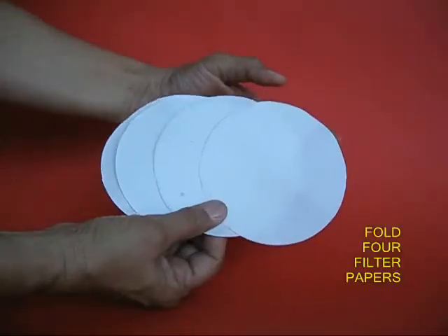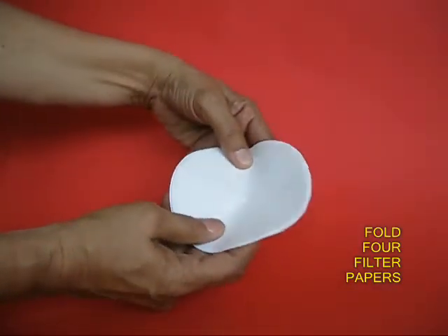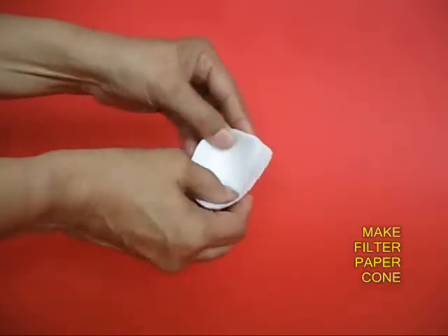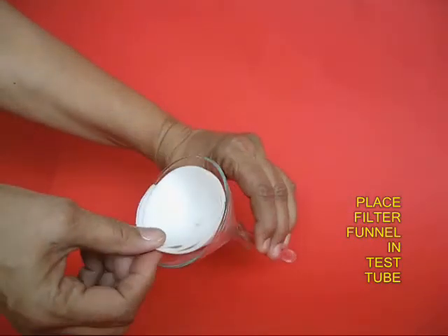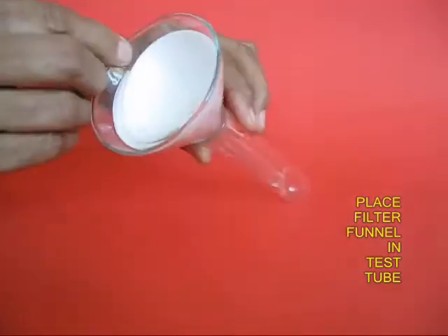Mix it well. Then take 4 filter papers. Fold these circles into half and a quarter to make a filter funnel. Place it in a glass funnel and put the glass funnel in a test tube.